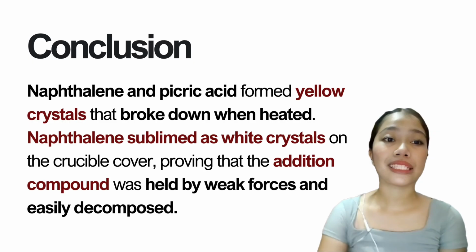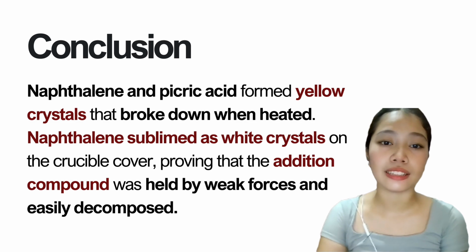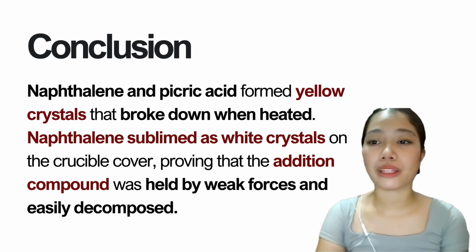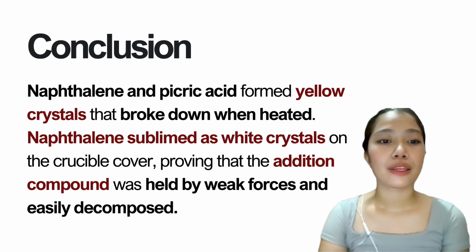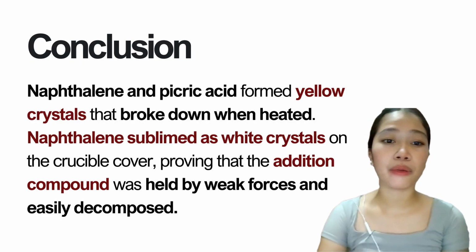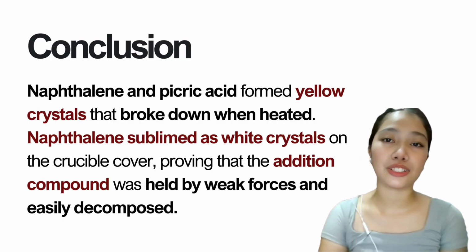So to conclude this experiment, naphthalene and picric acid formed yellow crystals that broke down when heated. So naphthalene sublimated as white crystals on the crucible cover, proving that the addition compound was held by weak forces, and easily decomposed. So this is the formation of the addition compounds.